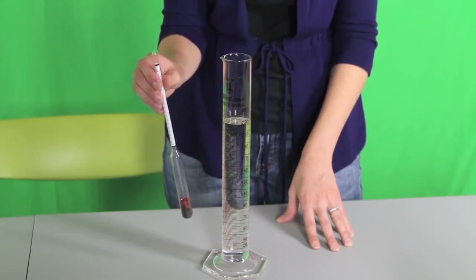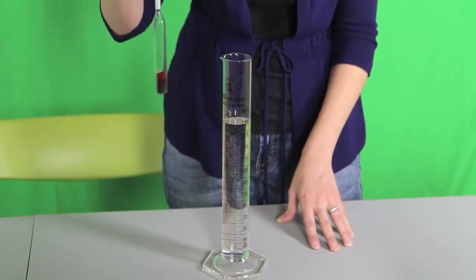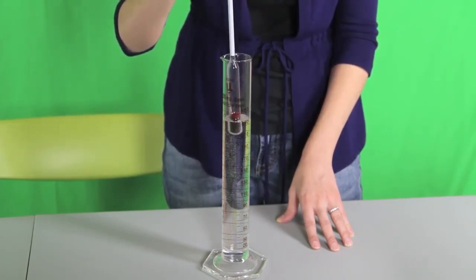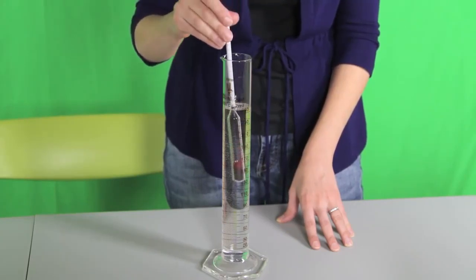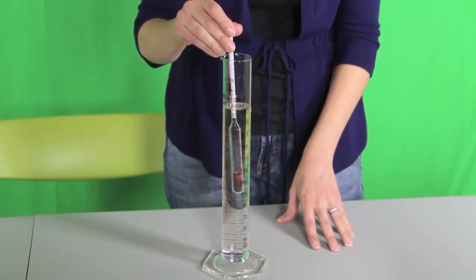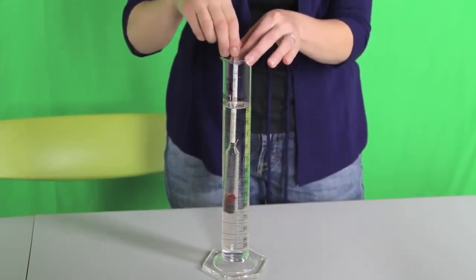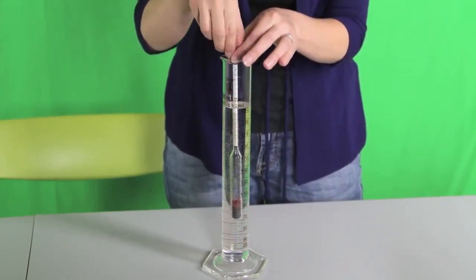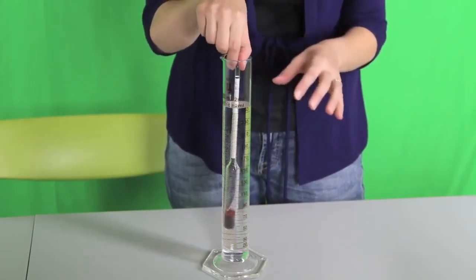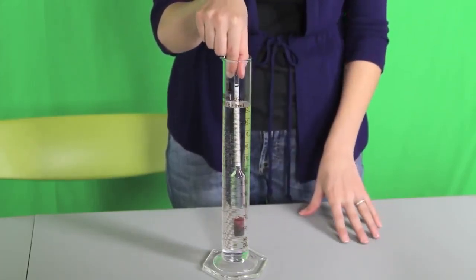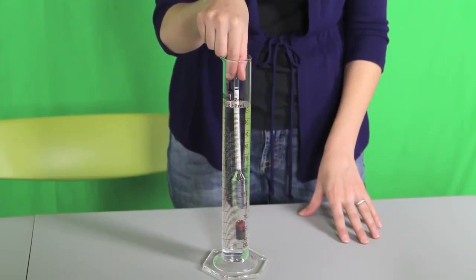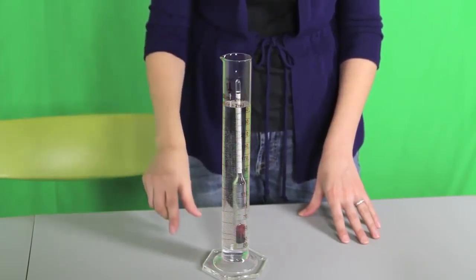Next, hold the hydrometer by the top and slowly lower it into the test cylinder. Just before you let go, twist it so that it slowly spins. This ensures that no bubbles cling to the hydrometer and cause it to float higher than it normally would. Drop the hydrometer while twisting it.